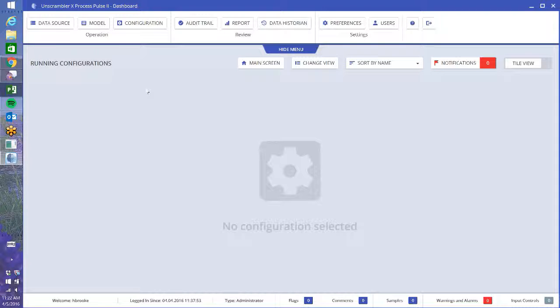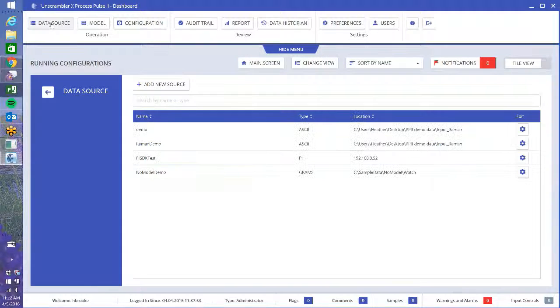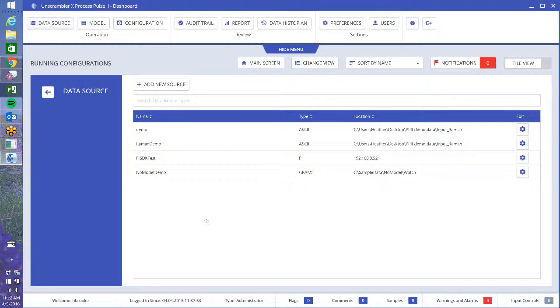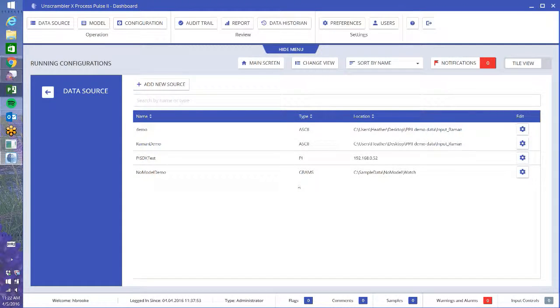The first step is to create your data sources. This is where you're going to import your data from, this is your raw data. As you see, I have a couple of setups already in here and there's different types of data that we can bring in.